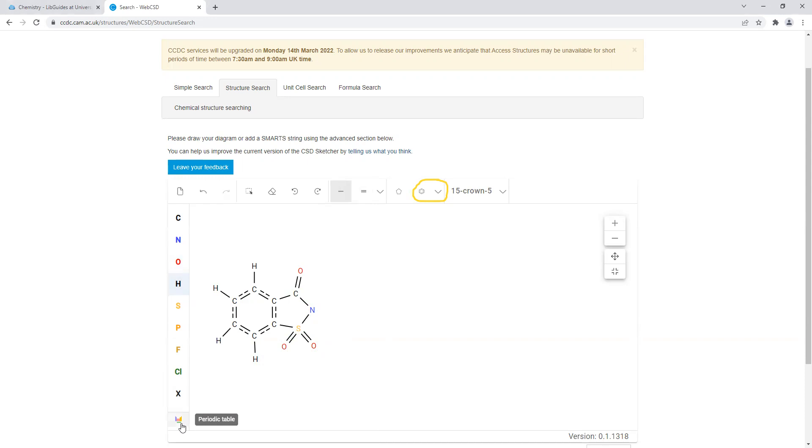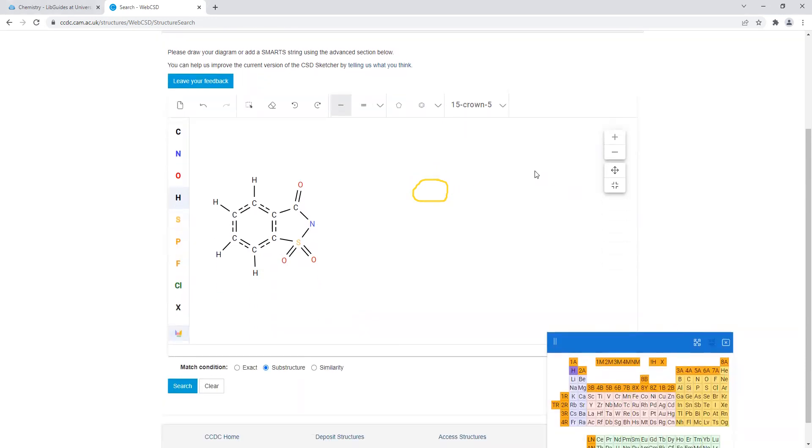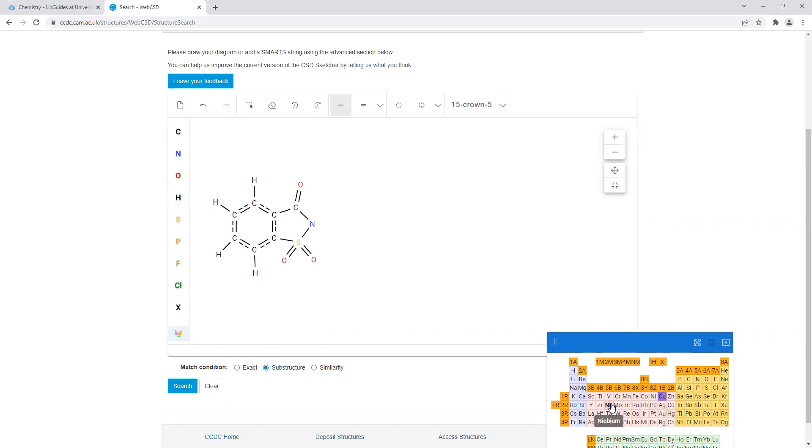Now we need to select our metal that was assigned to us by our TA. If we scroll down, and in this example I'm just going to use copper, but whatever your metal your TA assigned you would select it from the periodic table and you just place it next to the saccharinate ion. Do not connect it to the saccharinate ion, you just put it next to it.